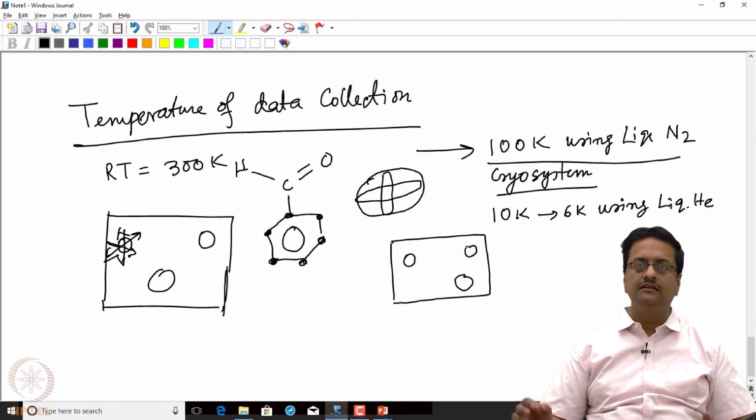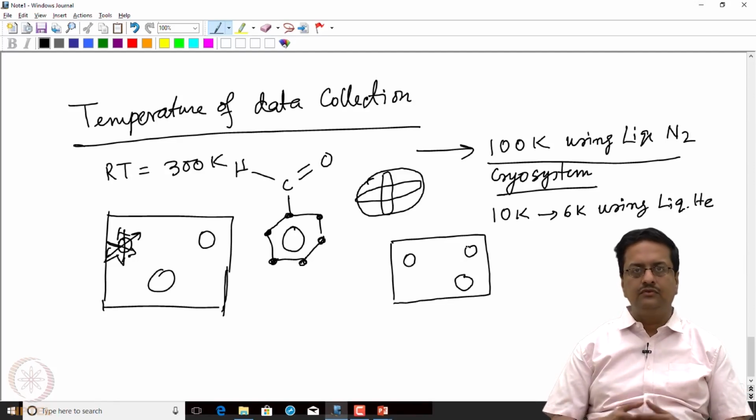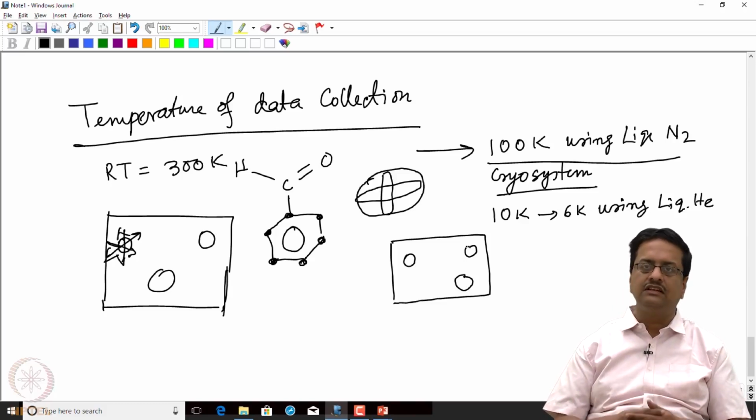So today we have learned about data collection strategies. We have learned a little bit about the detectors. I would request all of you to go through other YouTube videos which are available online to know more details about the CCDs and CMOS and other types of detectors, because the technical details of those detectors are beyond the scope of this course.